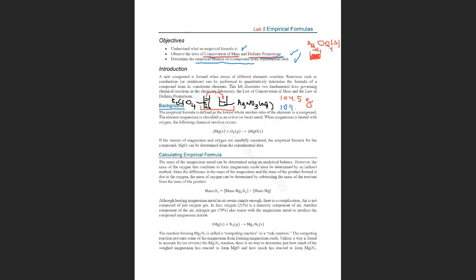And to my surprise, what happens? The same weight, the same amount of grams. That means it doesn't matter that there was a chemical reaction. The mass before the chemical reaction, the total mass of the elements, in this case potassium chromate and silver nitrate, whatever I mixed before, they recombine in a different way, but I don't create matter.